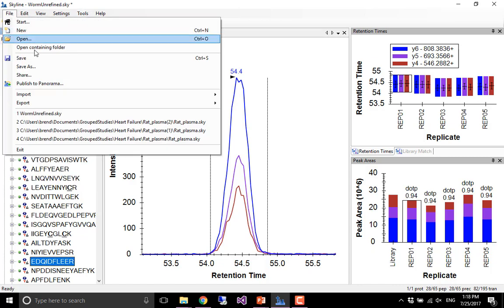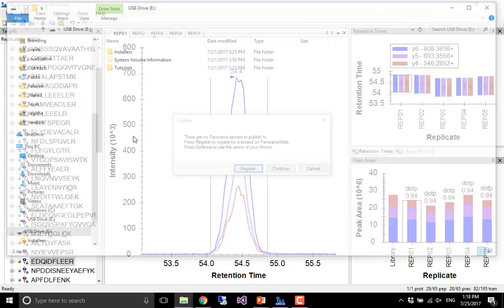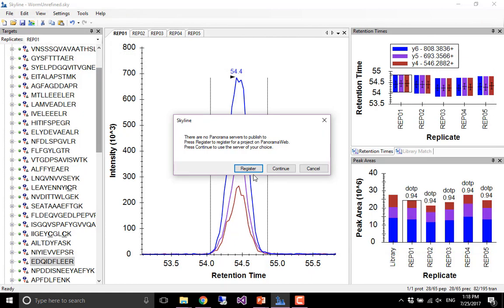And so you can do that within Skyline by going to this push file. Okay. There we go. So, yep. Now, this is new. I didn't know that, or maybe not even new. But so, yeah. Excellent. Well, you learn something every time you come to the course.